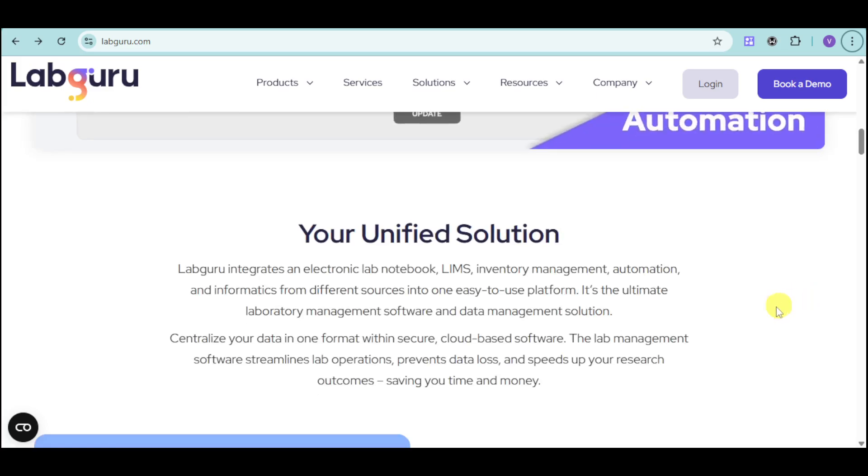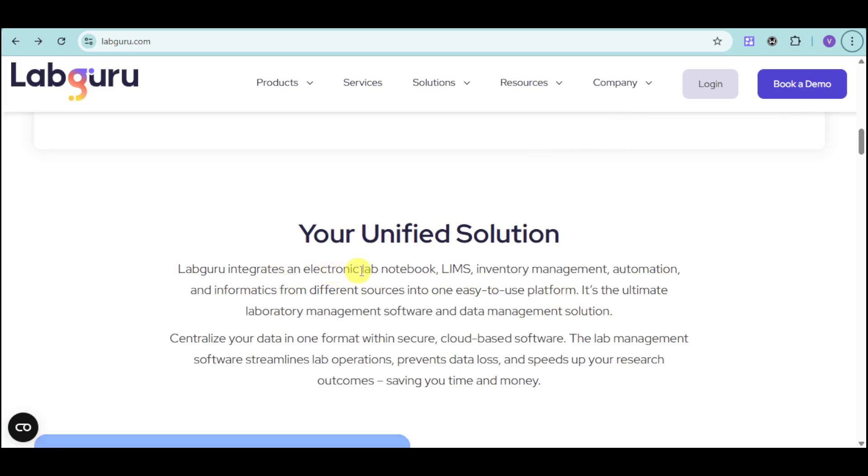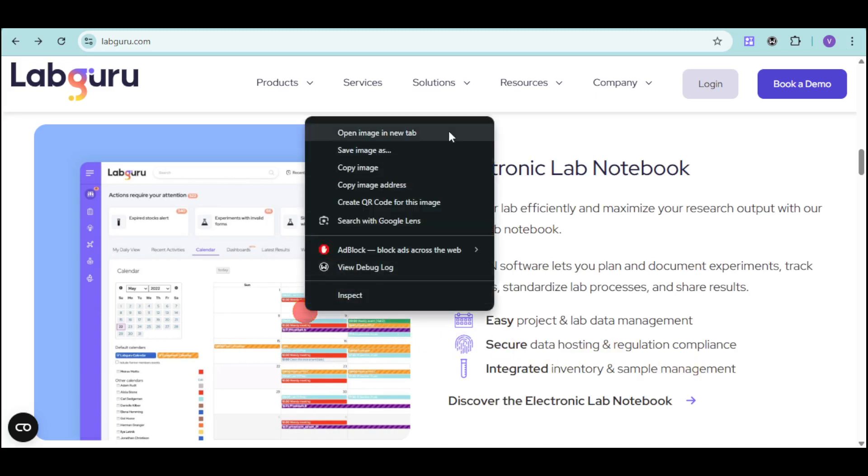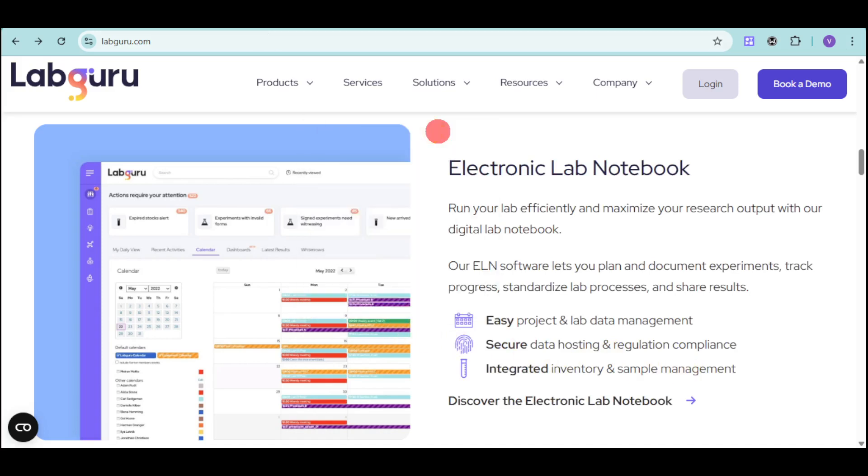LabGuru is your unified solution that can actually serve as your electronic lab notebook, inventory management, and much more. Their electronic notebook is an easy project and lab data management with secure data hosting and regulation compliance. They also have integrated inventory and sample management. Here's an example of what it looks like.